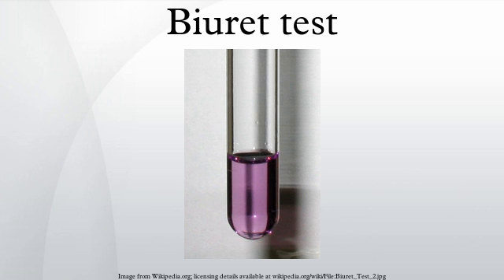In the Lowry protein assay, Cu+ is oxidized back to Cu2+ by Folin-Ciocalteu's reagent, which forms molybdenum blue. Tyrosine residues in the protein also form molybdenum blue under these circumstances. In this way, proteins can be detected in concentrations between 0.005 and 2 mg per milliliter. Molybdenum blue in turn can bind certain organic dyes such as malachite green and auramine, resulting in further amplification of the signal.